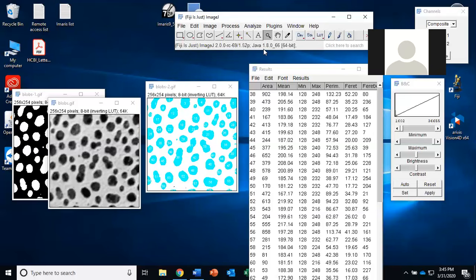The correlation stuff is much more difficult to use. You do have to be very careful about how much background you're subtracting. When you acquired the data, was one channel blazingly bright and the other one really low counts? You have to be much more careful on the acquisition side of it as well. Whereas finding the centroids and just measuring distances is a little easier on the acquisition side, but obviously more challenging on the analysis side.